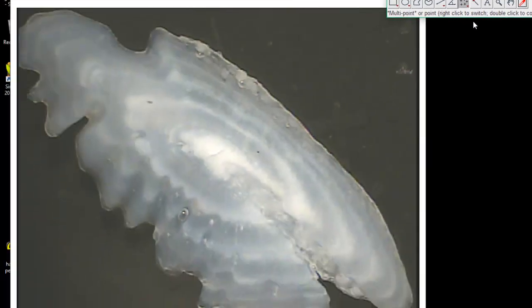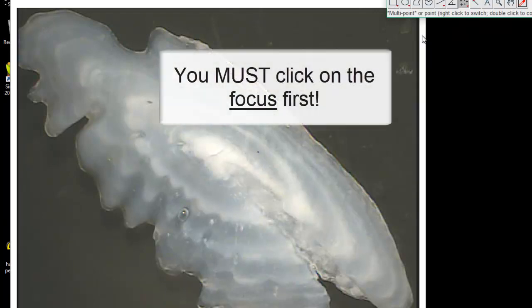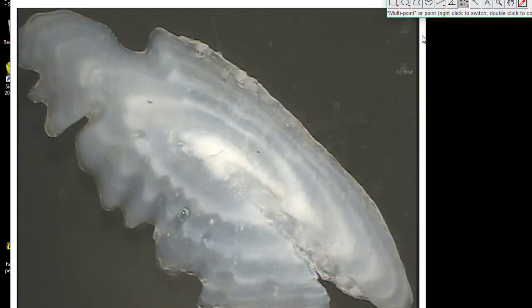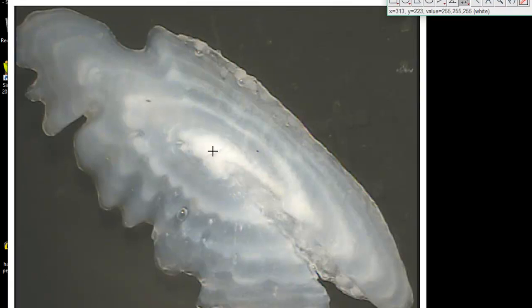Now I'm going to click on all those things. Here is the one thing you have to remember — the only thing you have to do to get this macro to work is click on the focus first, because everything is measured from the focus. The only way to tell the macro which dot is the focus is to click on it first. Everything else can be in any order.